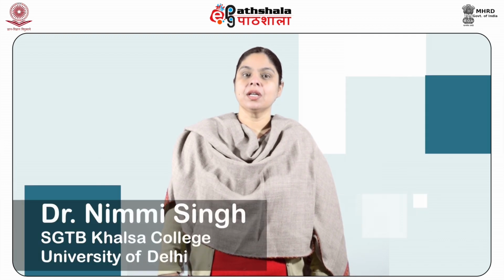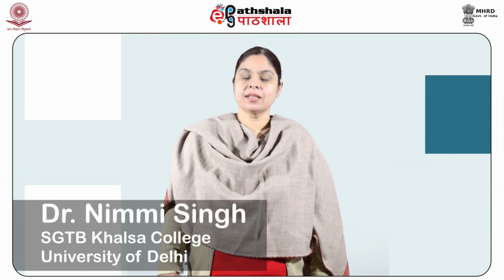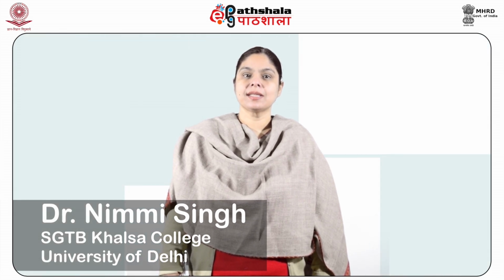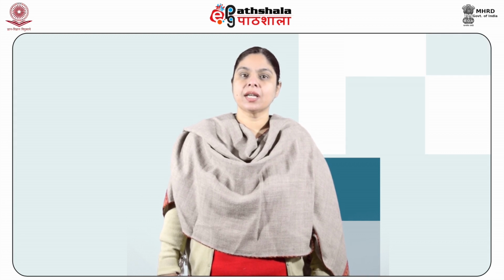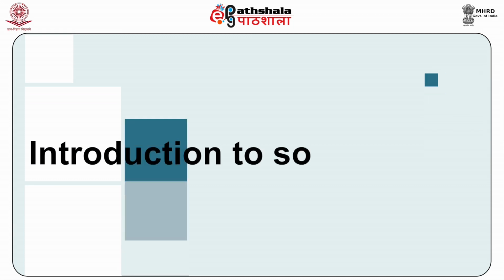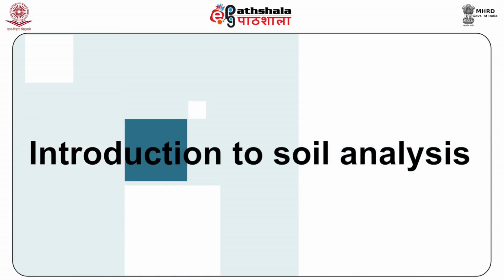In this module, we shall now learn about the methods for soil analysis and thus the comparison between different soil samples, and also the different techniques used for paint analysis. Now, we'll first introduce ourselves to soil analysis.